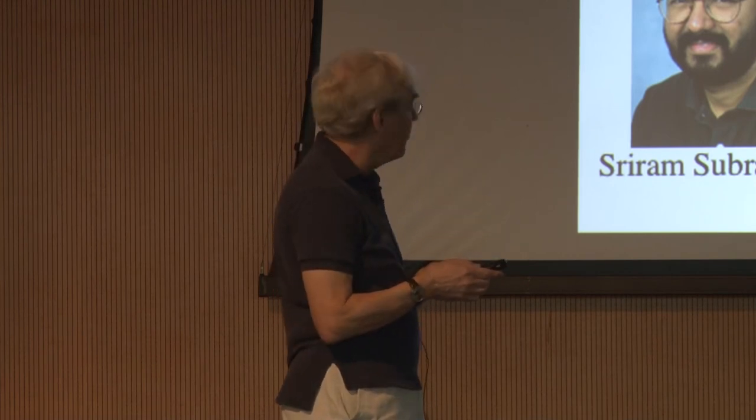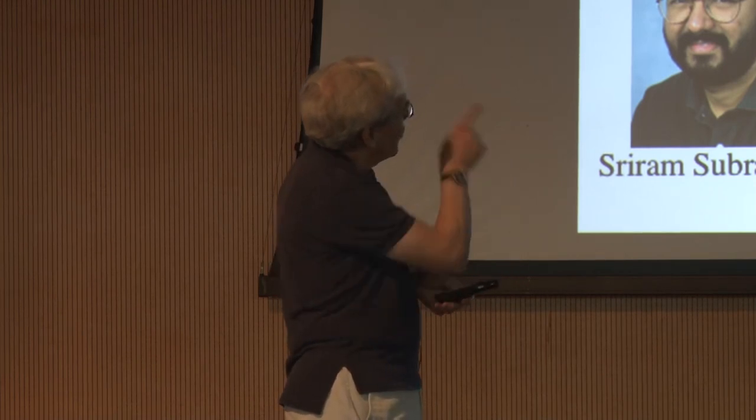So with these 20 images, that work that I told you that Bettina Böttcher, who was on an earlier slide, worked with Tony on the first sub-nanometer structure. That was done on this 200 kilovolt Hitachi with a field emission gun. And we were the only ones for about 3 or 4 years with that quality of data. All of the other people didn't get their field emission guns till later. So actually, there's a big advantage in having a technological lead. Because once you've got it, you have it and nobody else has it.